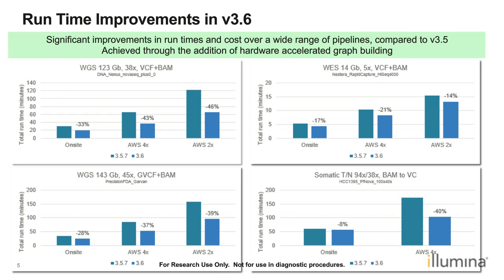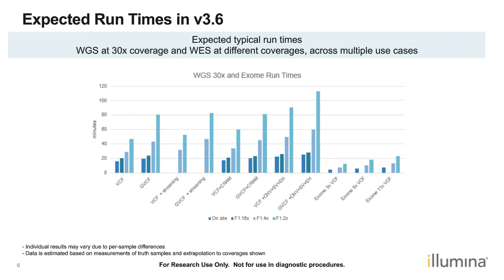Okay. Here is just another set of benchmarking plots that we have, and this once again shows the runtimes that we are getting for various runs that we're doing, right? So we have VCF, GVCF, and VCF streaming. When we say streaming, these are typically the cloud users who stream data from their S3 bucket. And then we are enabling all the callers over here, right?